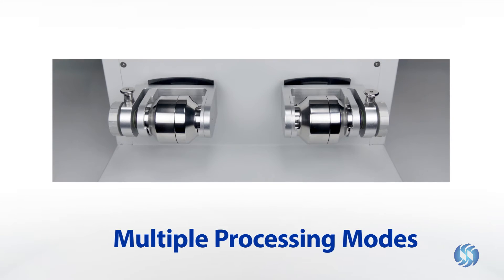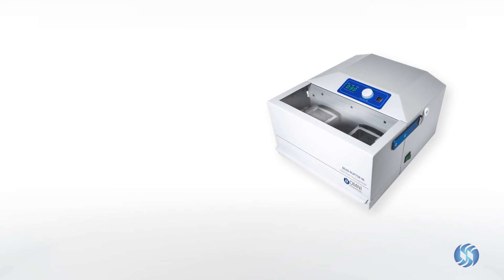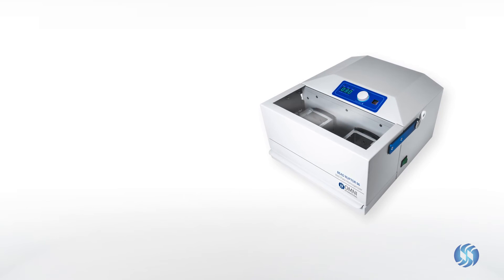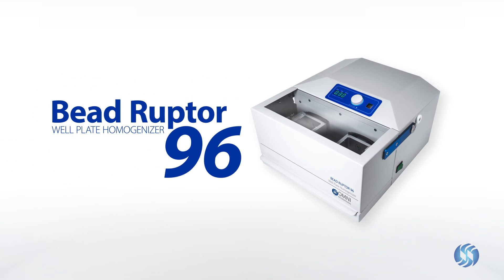With multiple processing modes and a wide range of bead mill accessories, the Beadruptor 96 is an ideal homogenizing solution for laboratories requiring high throughput processing and milling capabilities in a single device.